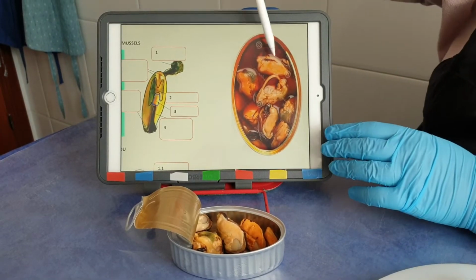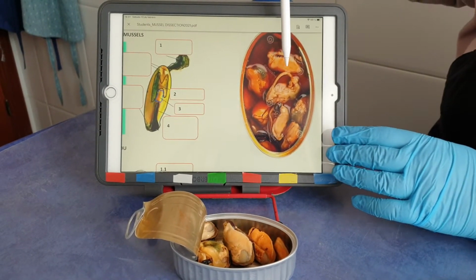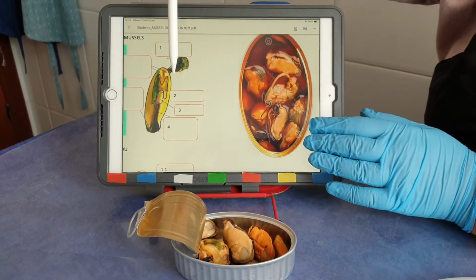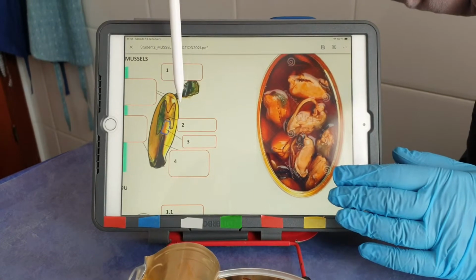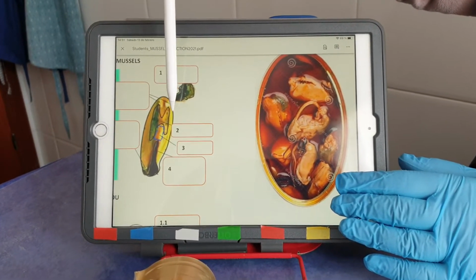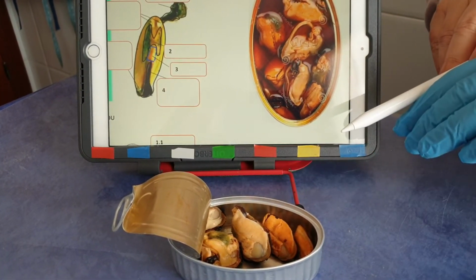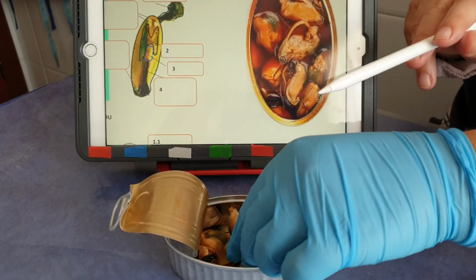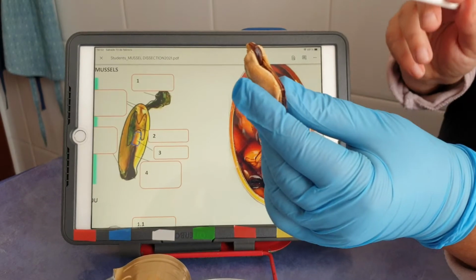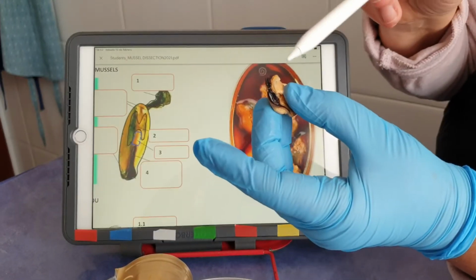We are going to start with thin mussels. And why? Because we can see much better this organ that has a letter shape, like an H, because of the treatment that this mussel has. The first thing, when you pick one with your hands, is to know where the anterior area is and where the posterior area is.